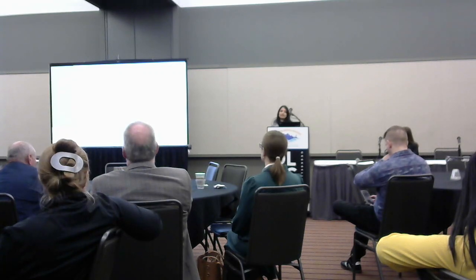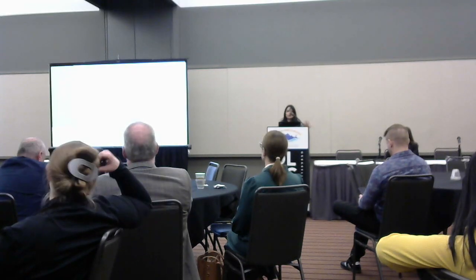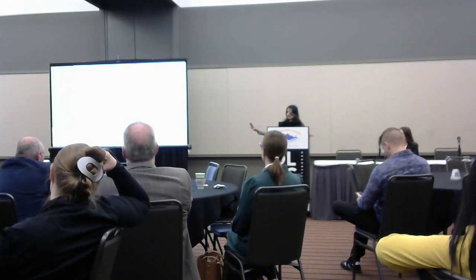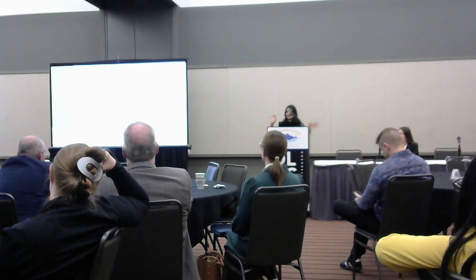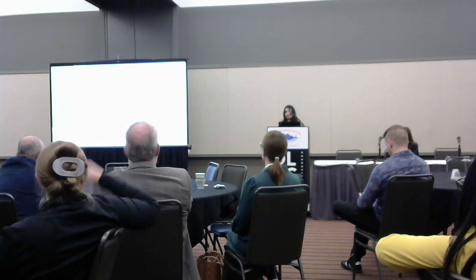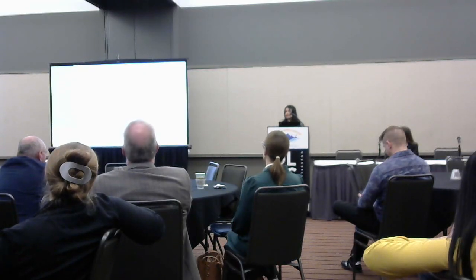The second integration challenge has been workflow compatibility. As you know, most of our microscopy users are more used to Windows-only or GUI-based versions. So to completely go into a Linux world with a command line interface, there has been a big gap there. Again, with limited coding experience, it has been very hard to push the users to build something on their own and optimize any pipelines.